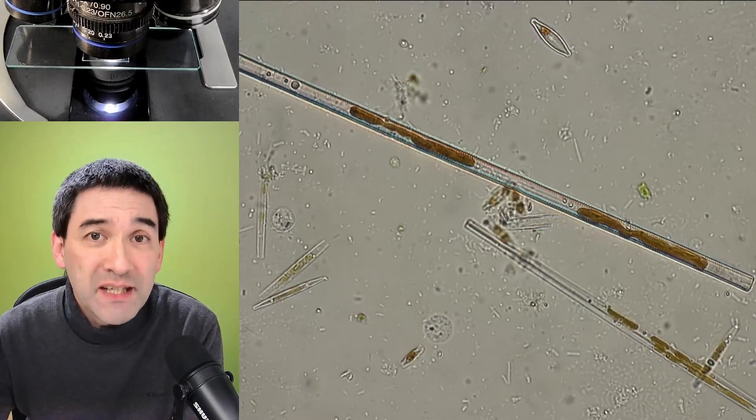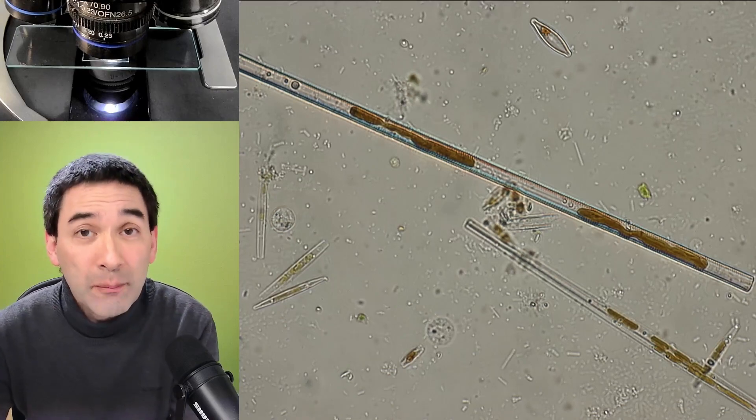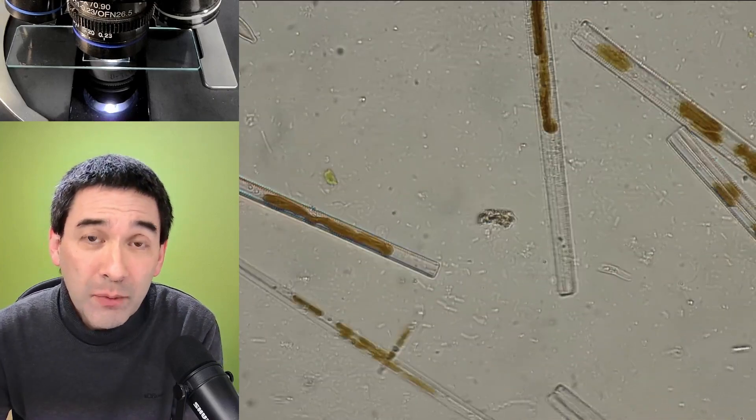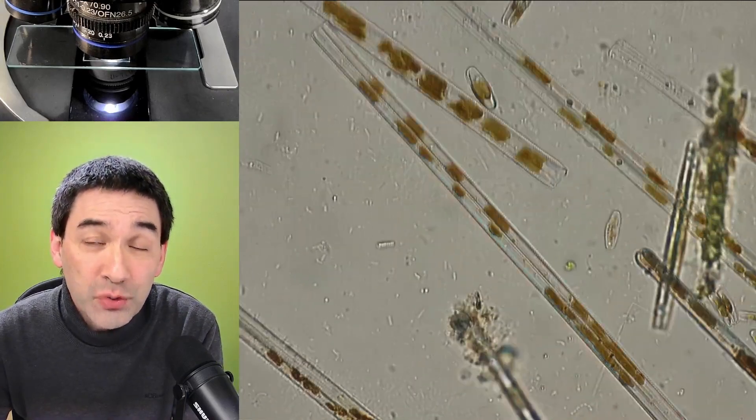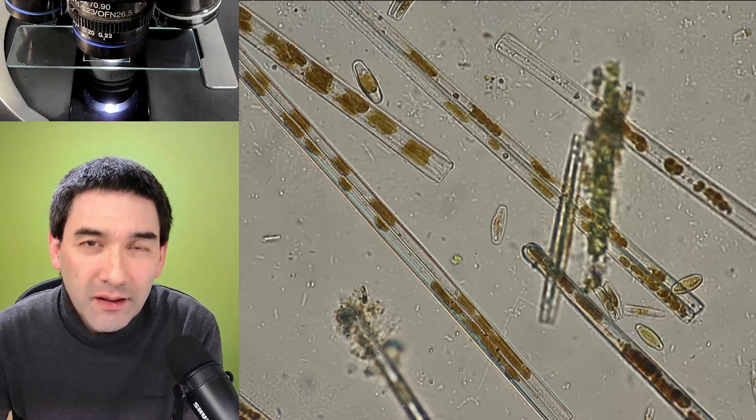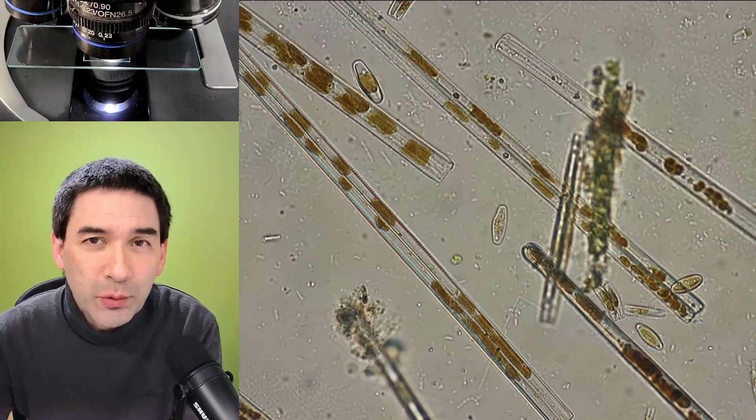Currently I'm looking at the specimen using a 60 times objective, and I'm going to be using the same objective also for the other two slides. We're going to compare them, and I think it's quite interesting what we're able to see here.